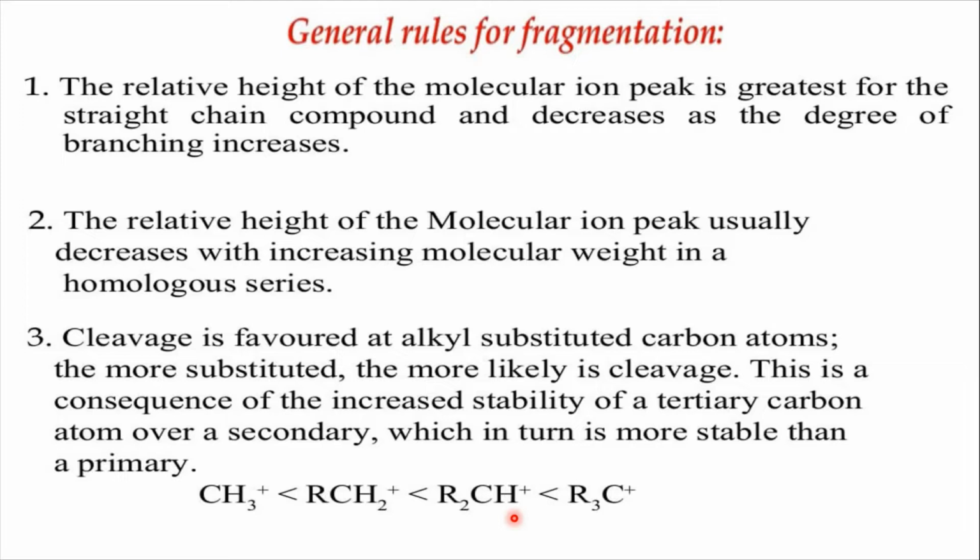First of all, the molecular ion is formed by the bombardment of energetic electrons. Then the molecular ion undergoes the fragmentation process in which free radicals or neutral molecules are lost from the molecular ion. The general tendency for fragmentation is to give the most stable fragments possible. Radicals are inherently more stable than carbocations since they are less electron deficient. However, carbocations are stabilized by some factors.